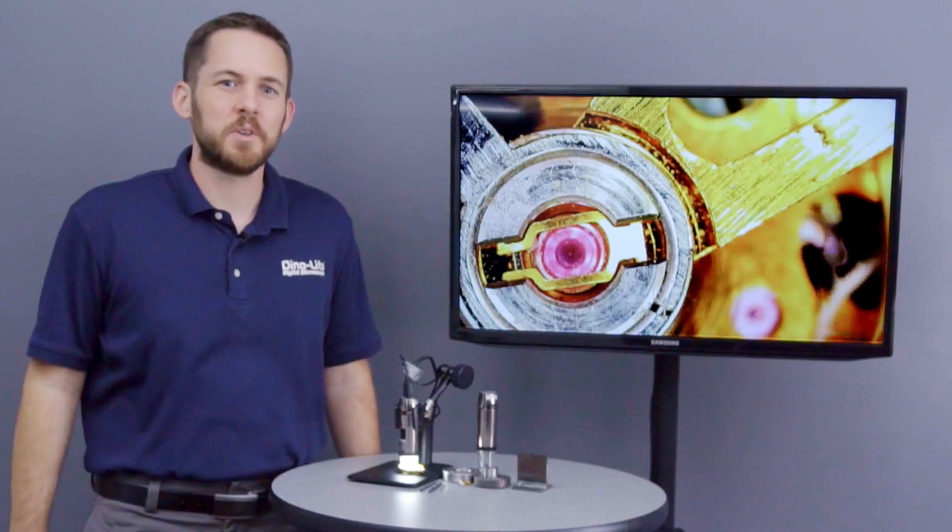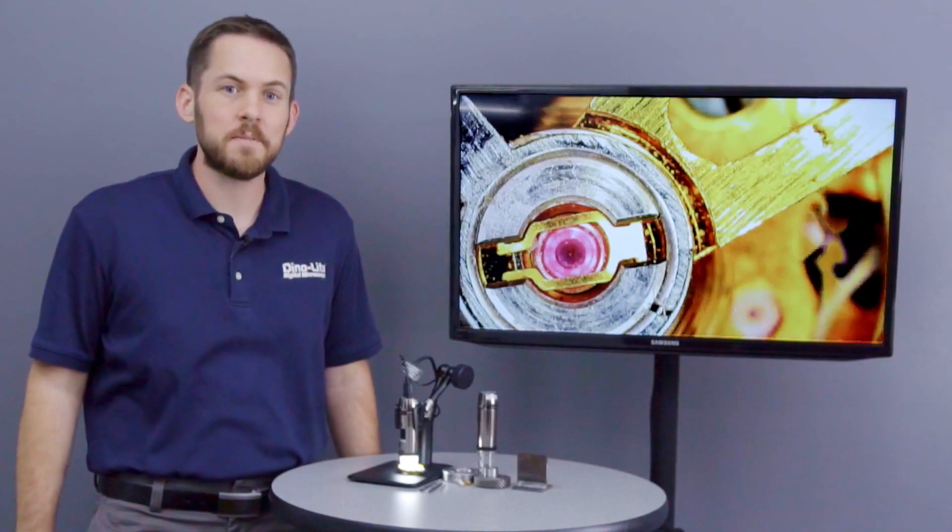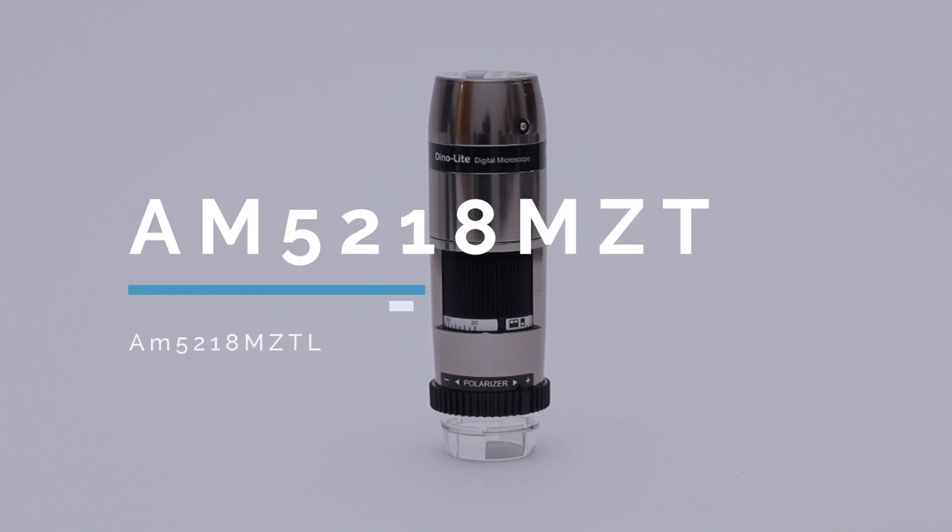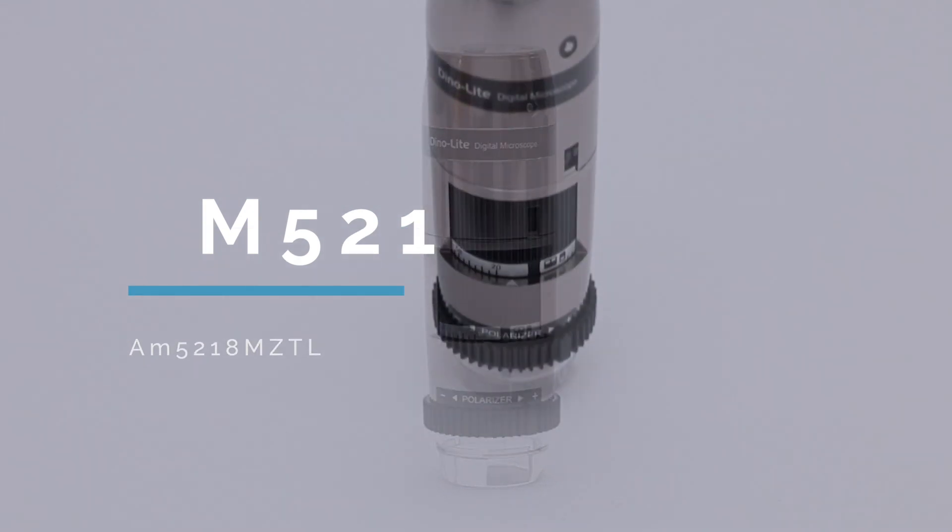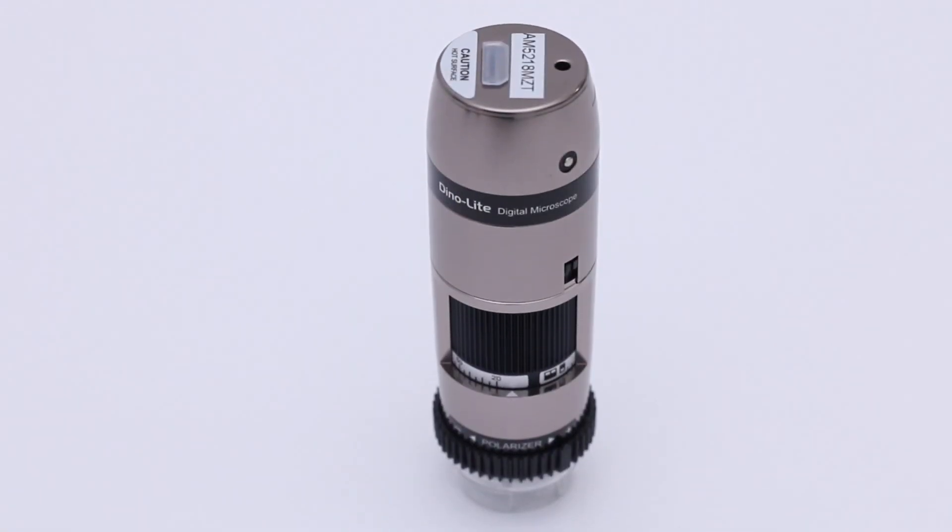Hello, I want to show you our industrial grade edge series microscopes, the AM5218MZT and AM5218MZT-L, which feature a digital output for HDMI or DVI monitors.